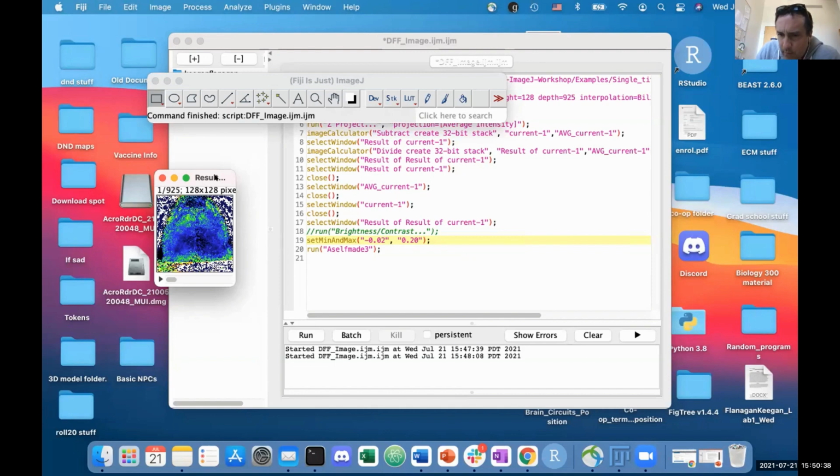And then could you talk about how we can use it in our projects? Yeah, so I guess this delta F over F calculation is commonly done with functional indicators in general. It doesn't have to be mesoscale calcium imaging in the brain per se.